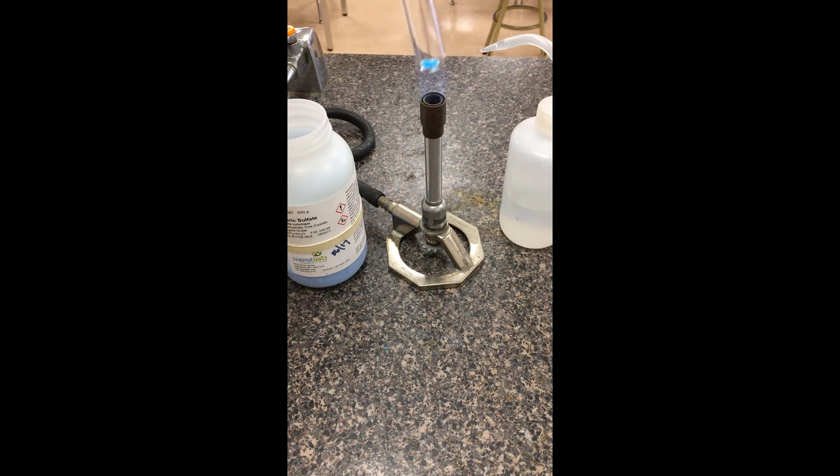And again, what we're trying to look for is what's happening to that blue powder as the heat evaporates off some of the water. I have this Bunsen burner on the blue flame setting. So that's going to be the hotter flame.